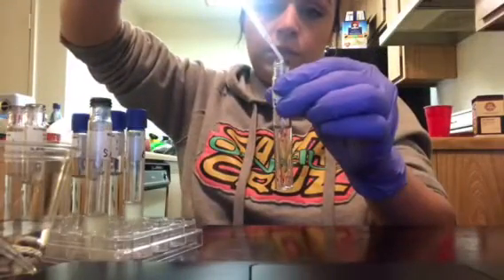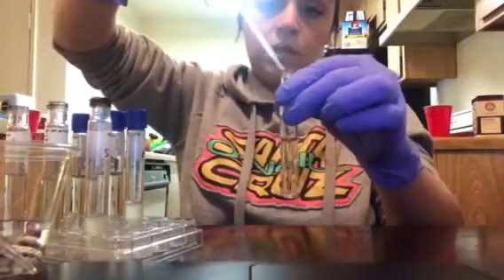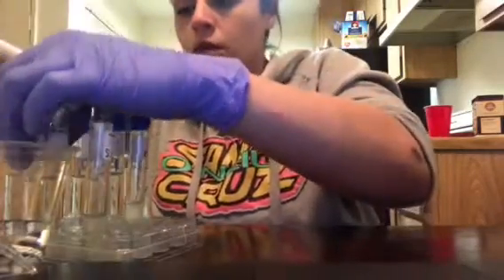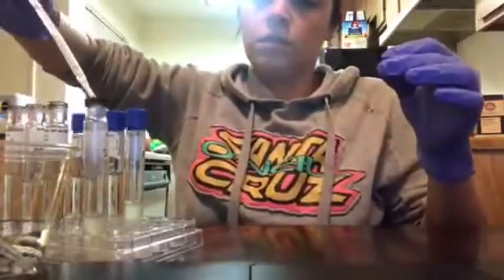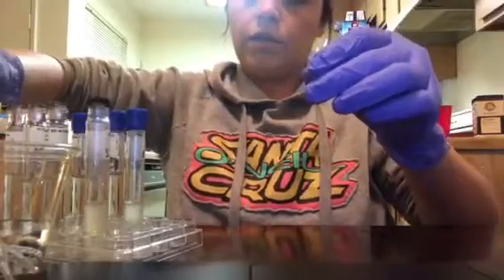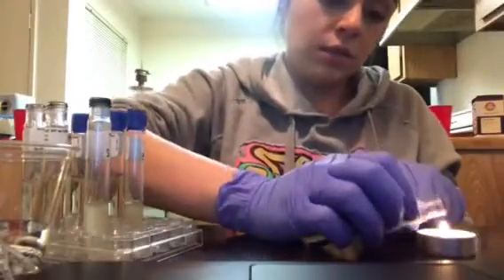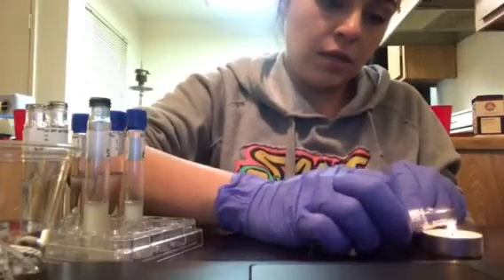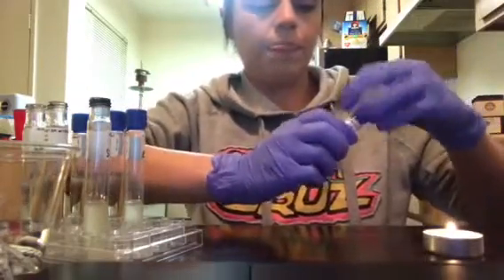So this is the 1%, and then the 7%, and the 15%. So there's 2 drops in each. And then place that back in the alcohol. And then now that those are in there, I'm going to flame these to sterilize it again. And then I'll be able to put the caps back on.